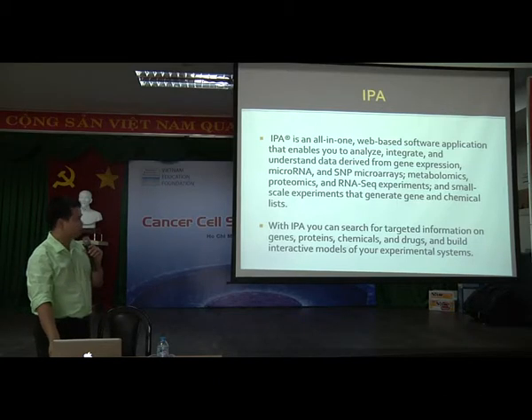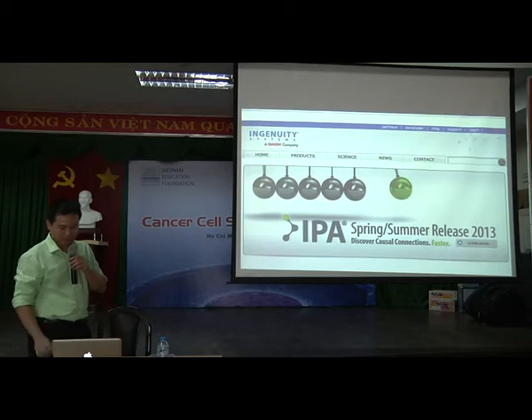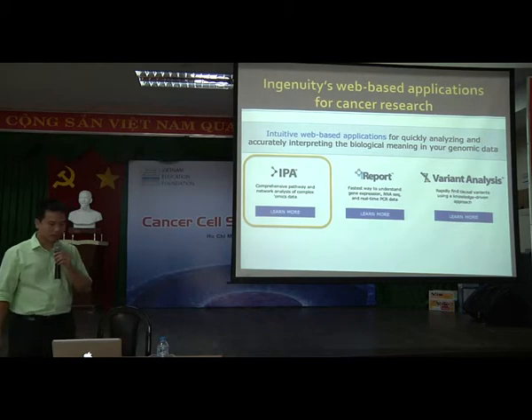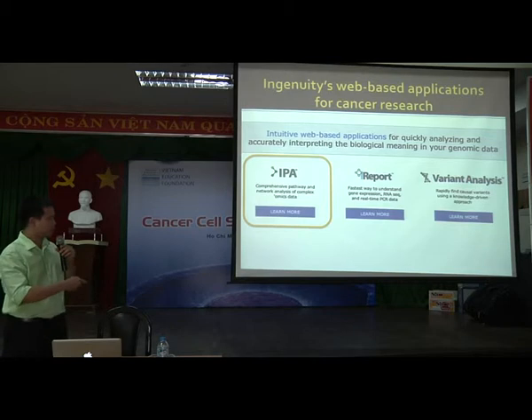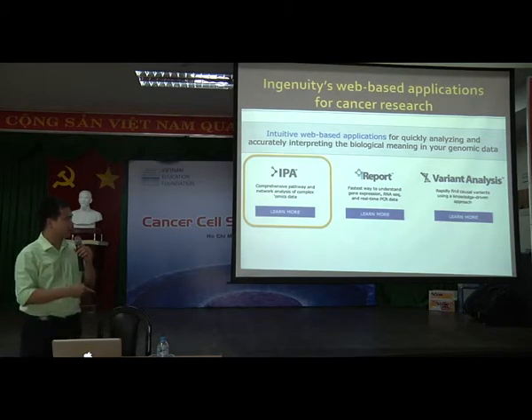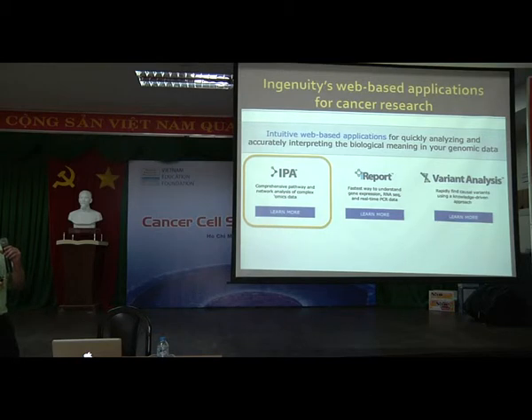for your experimental system. This is the website of IPA, and originally they only had one product, which is named IPA, and the company name is Ingenuity Systems. It's based in California and has been recently bought by Qiagen. So IPA is the first product of that company, and now they have a certain service, which is called iReport, and also the variant analysis. So today we focus on IPA, which will allow us to have a comprehensive pathway and network analysis of complex omics data.